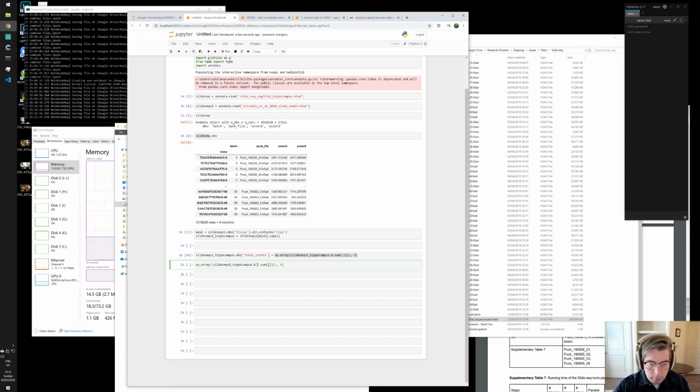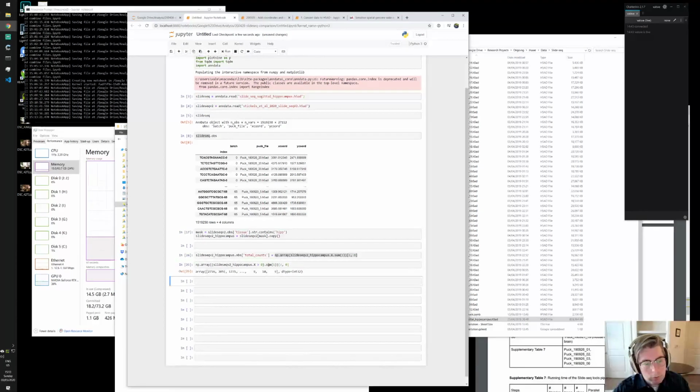Instead, I'm going to make a new binary matrix that checks whether the entries are larger than 0, which is a very quick operation for sparse matrices, and I'm going to sum those. So now we actually get the number of detected genes, the unique genes which are detected, not the copies of them, just whether a gene was ever counted or not.